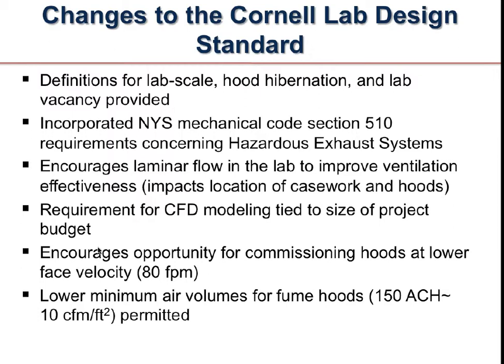the exhaust analysis was way at the end. We put that front and center at the beginning because you need to know what chemicals you're working with and what you're going to be exhausting, that some things are going to require specialized exhaust.